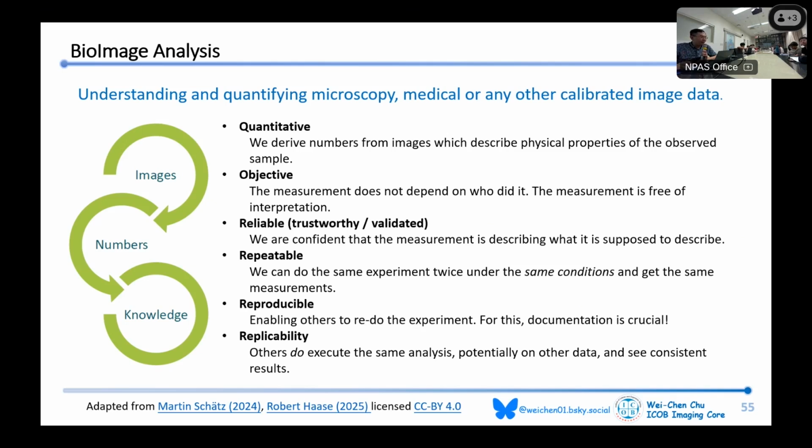And it should be reliable: you should do some validation to know what measurement you are doing. You can repeat the measurement several times, and each time you get the same result, so it should be repeatable.